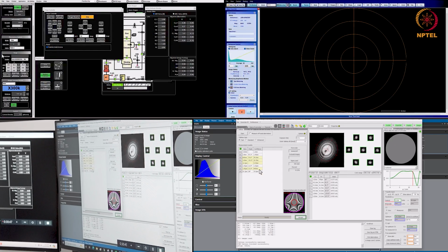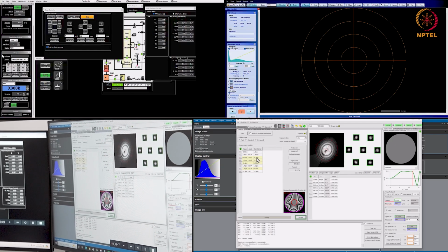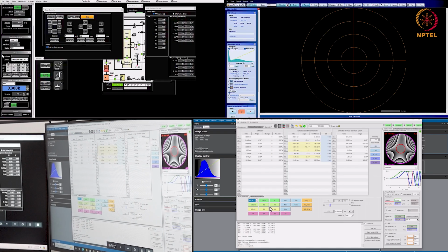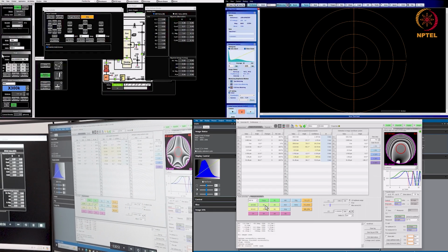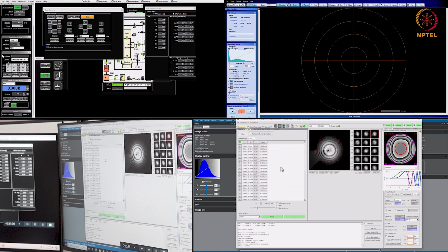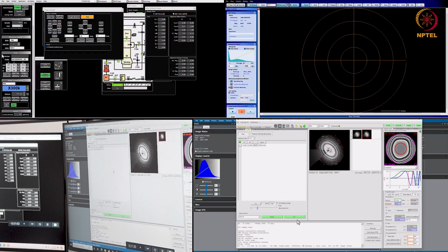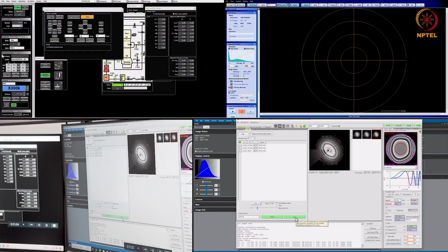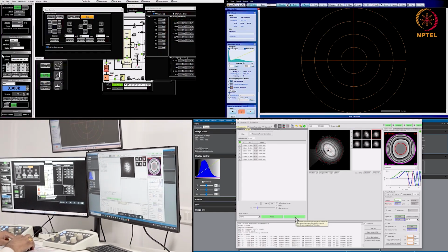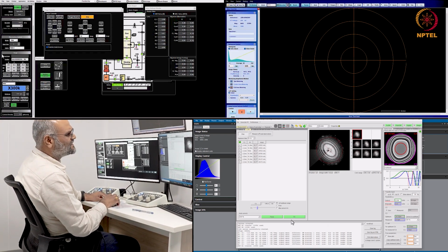So let us accept this, but what I'll do is, with a 15 milliradian Tableau tilt and the higher order astigmatisms, I'll not correct now. I'll only start with correcting A2 and B2 here. Let me accept this, and let us correct with A2 and B2, and let me start C1A1 once again, and iteratively we have to keep repeating this. So I can see that this induced quite some change already.